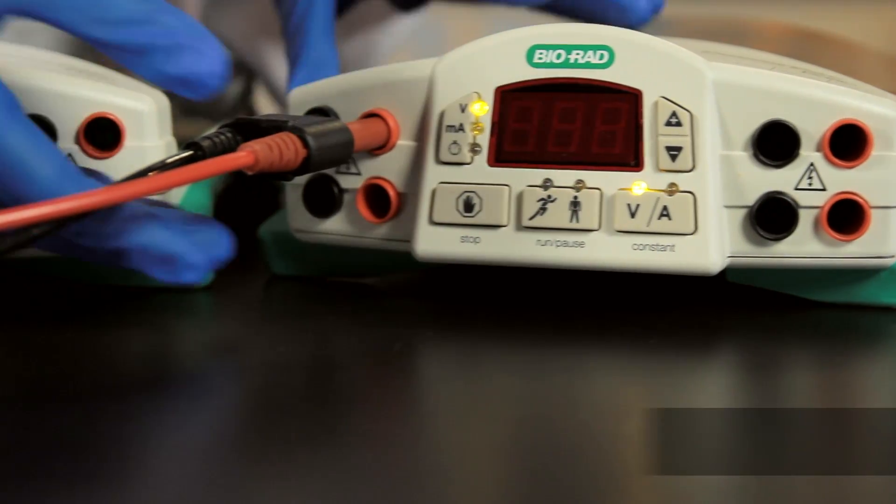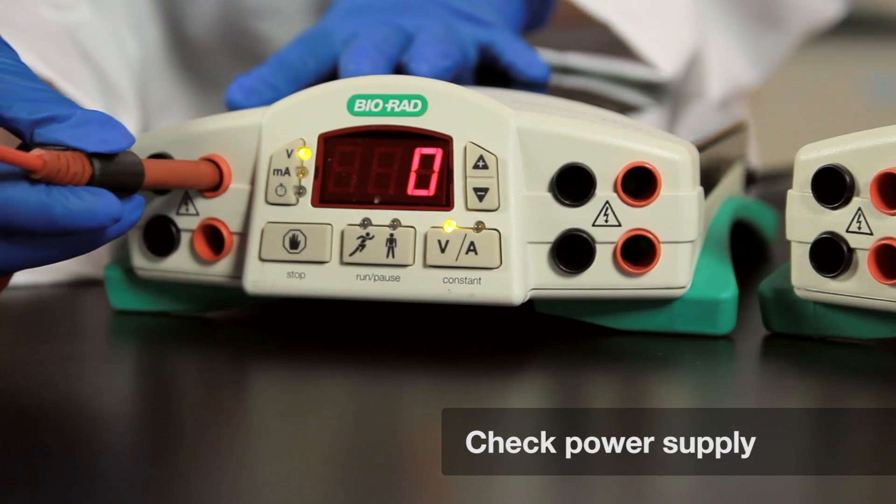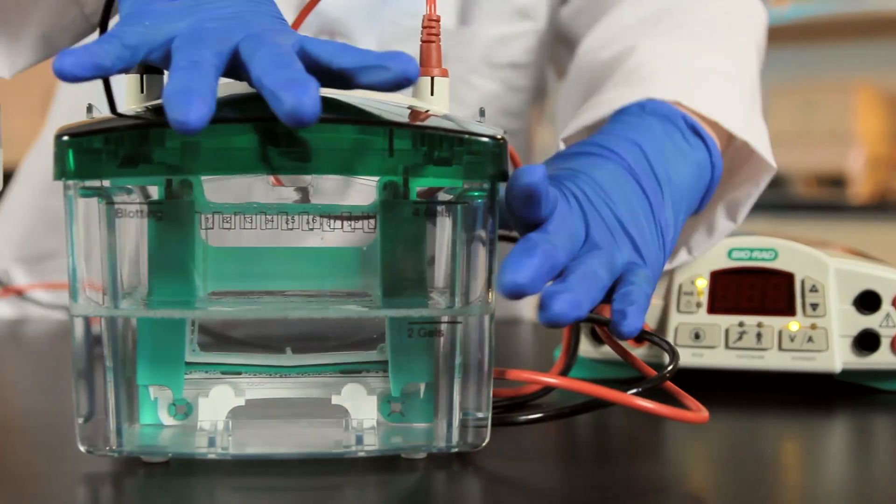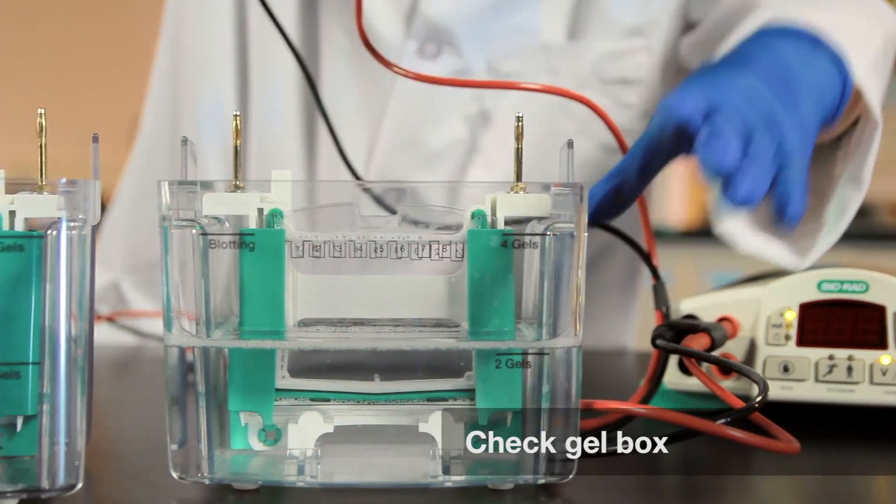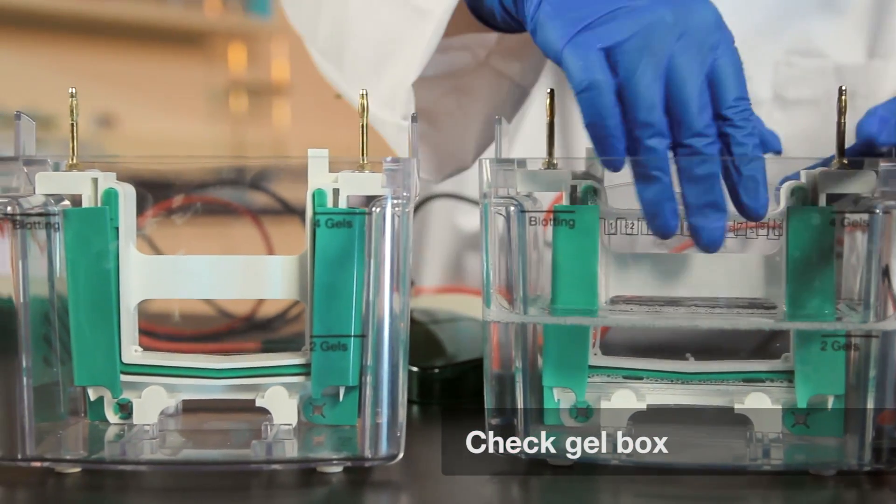Occasionally, the problem is due to a defective power supply. Try running the gel using another power supply to see if the error persists. Or, the problem could be with your gel box. Run the same gel in a different gel box, but with the same power supply to see if the E1 error persists.